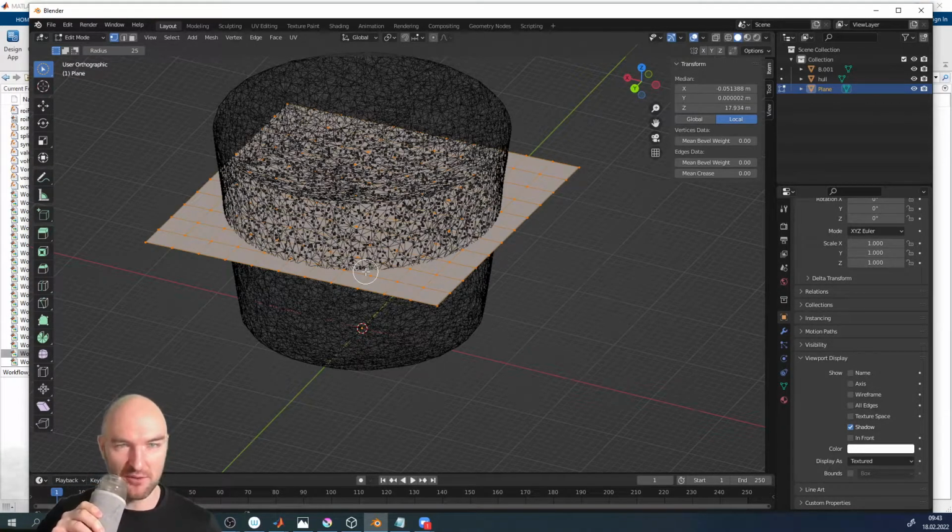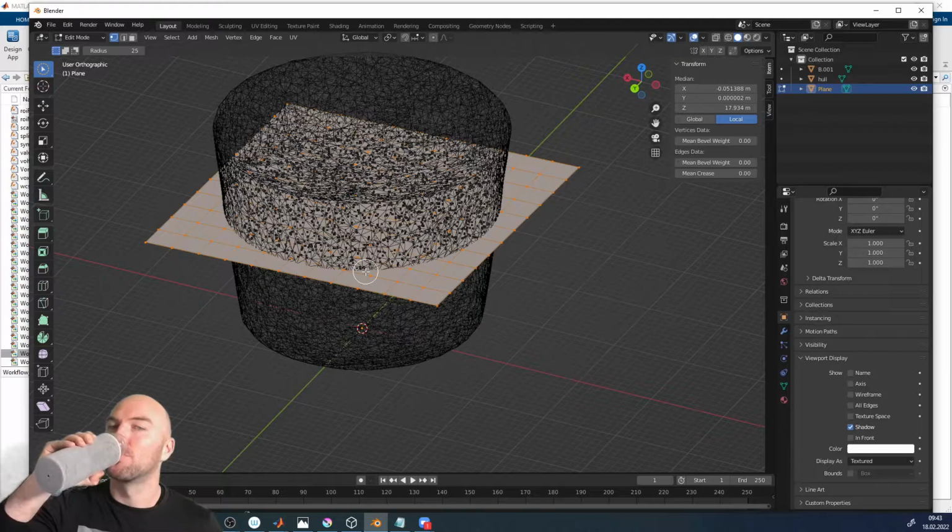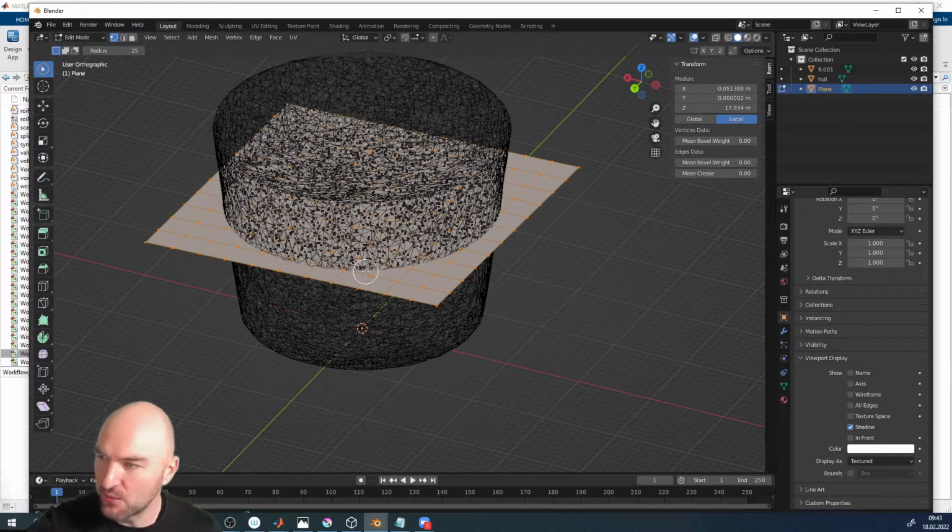And I think I wrote a paper once that goes through all of the statistics and everything. But you're not going to worry about that. Okay, so your mesh is loaded fine. That's good. So you can later show us how beautiful your meshes are.